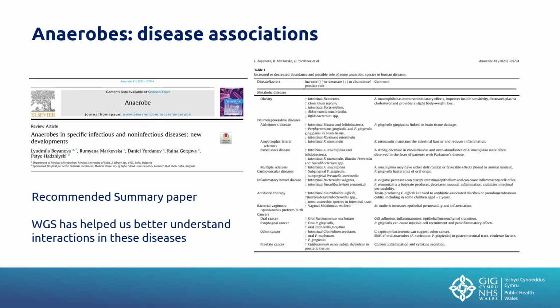They've detailed here some associations that have been put together more recently, and I'll highlight a few in the following slides, but all of it is supported by being able to perform whole genome sequencing.